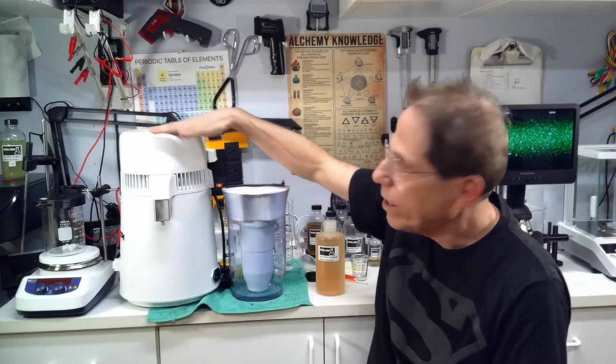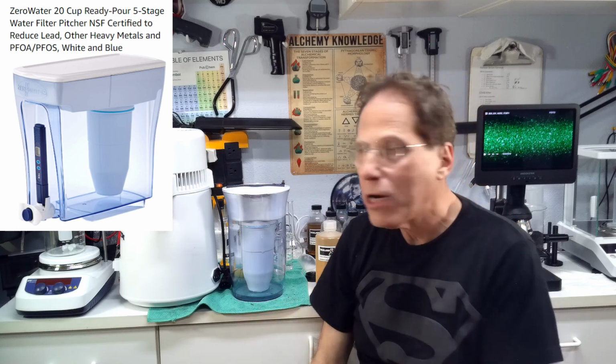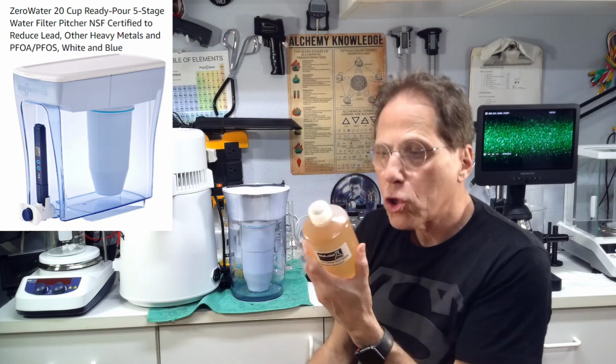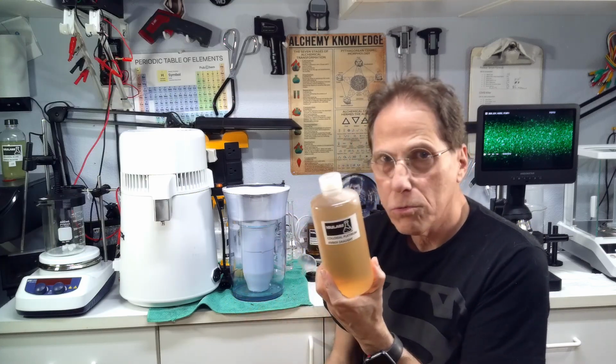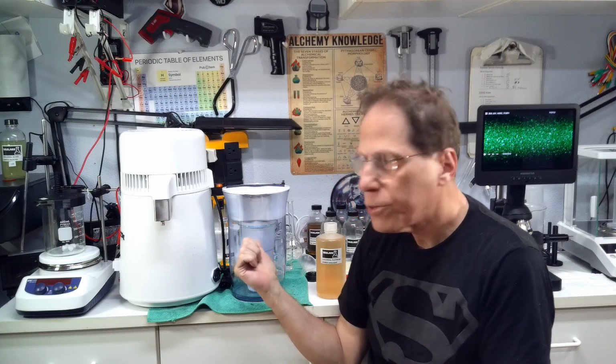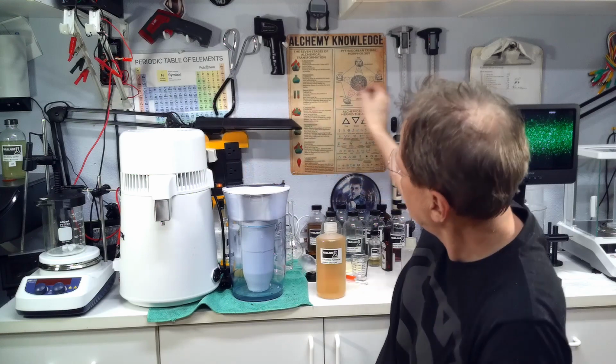An alternative to distillation and RO water is this Zero Water filter. Now, I know in an earlier video I said you really shouldn't use the Zero Water, but I went through so much distilled water going to do my platinum that I was running out of distilled water. And so out of desperation, I started using the Zero Water. And it does work. Zero Water does work for colloidals. I've used it. This pitcher will produce 0 parts per million water as measured on a TDS meter.